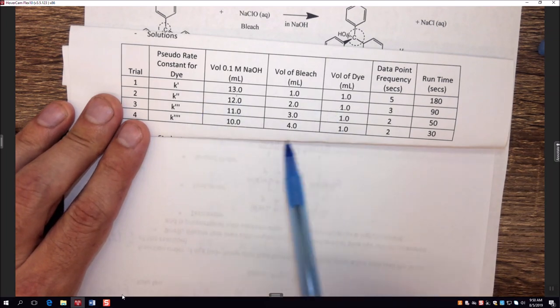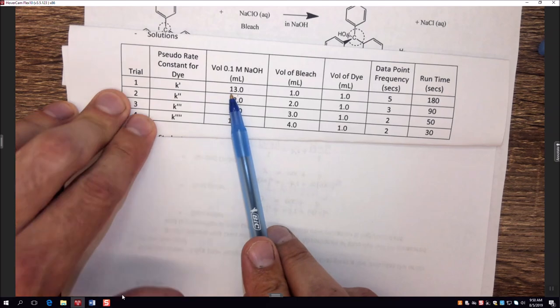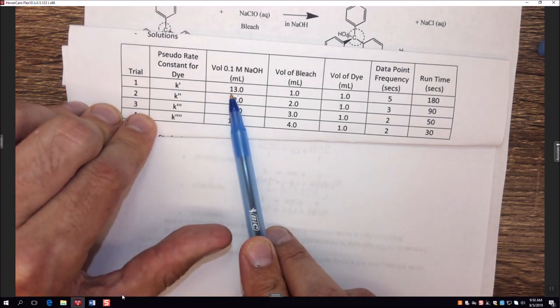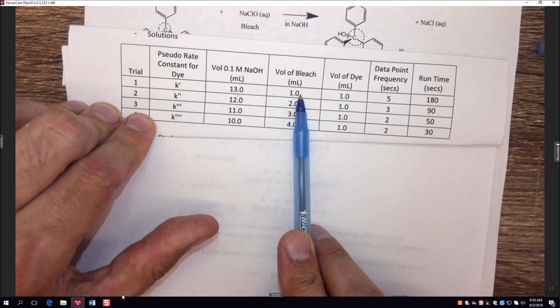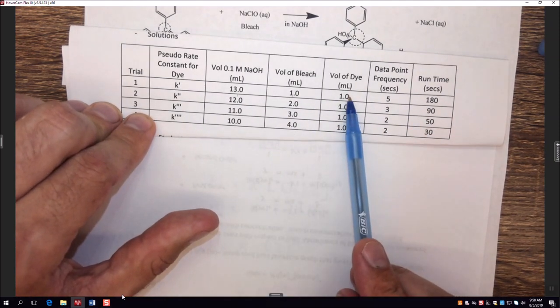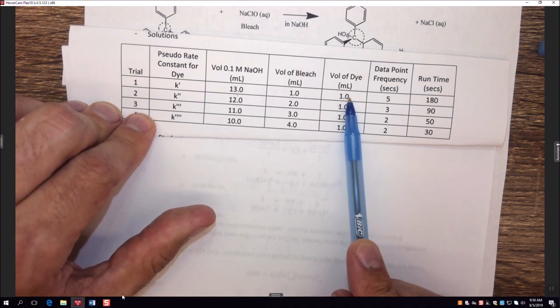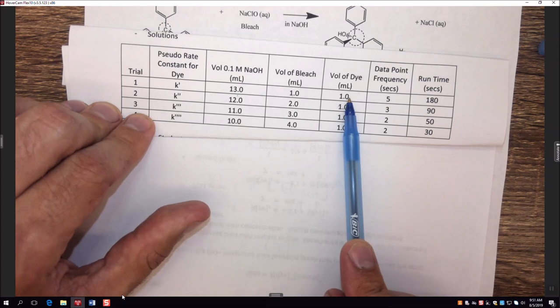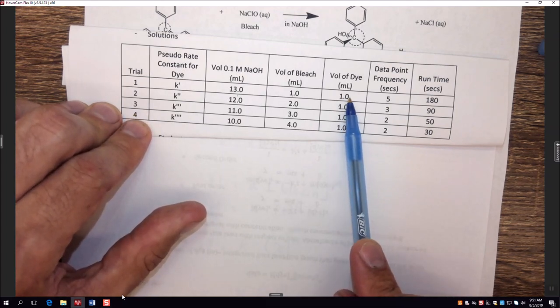Tim will show you this in a minute, but what's really important is we don't mix these things together until we're ready to go. So essentially what we're going to do is mix our 13 milliliters of NaOH into our vial. Then we're going to add 1 milliliter of bleach. And then only when we're ready to run the absorbance are we going to add our milliliter of dye. Because the instant we add that, the reaction is going to start. And we want to be capturing the absorbance of the dye as the reaction proceeds. And Tim will show you how to do that in a minute.